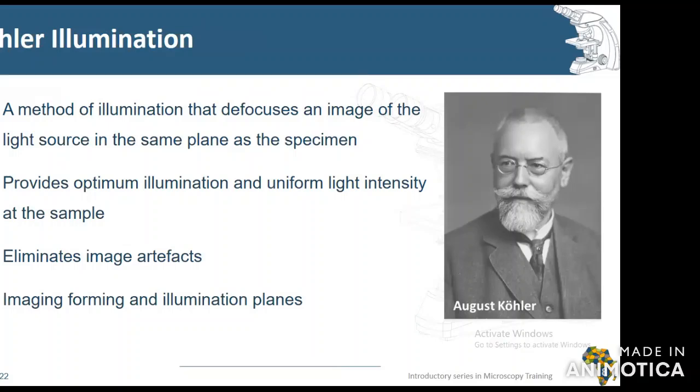Now, what I was trying to say is that the actual mechanism of how the microscope is arranged is in a linear plane, and what manufacturers do is collapse and package these linear arrangements of all the components of the microscope to make it look handy and fanciful for us to see. And that is what we carry all around.